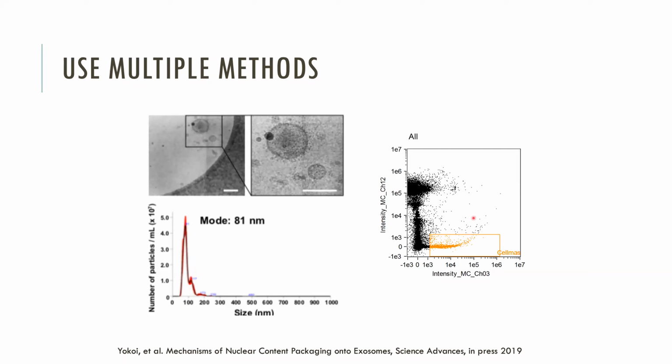And then this is what the imaging flow cytometry data looks like, and I'll show you a little bit more about that. So in order to publish this, you'll need to use a group of the methods that we just talked about.